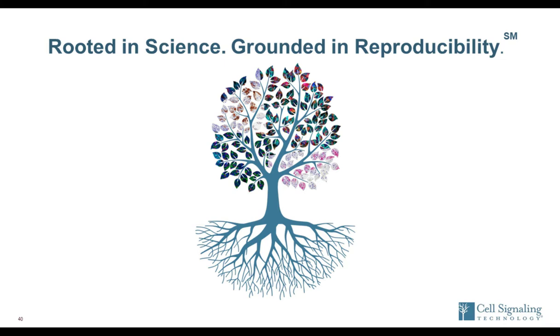And Chris, it looks like we have time for one more question. Are there particular markers you would recommend to better differentiate pro- from anti-inflammatory myeloid cells? Yes. So I discussed some of them in the presentation today. We talked about using arginase 1, of course, and IDO as functional markers.